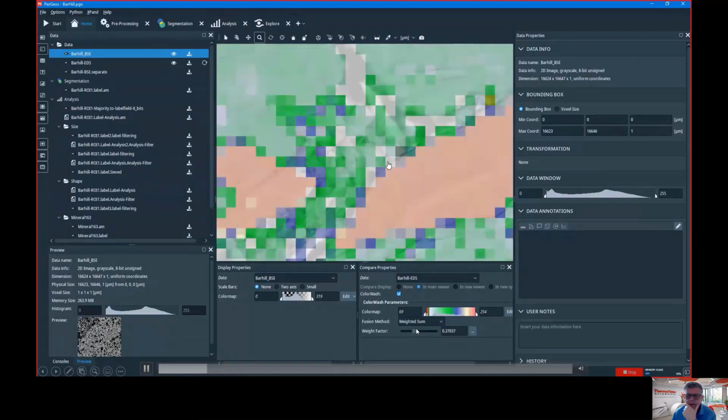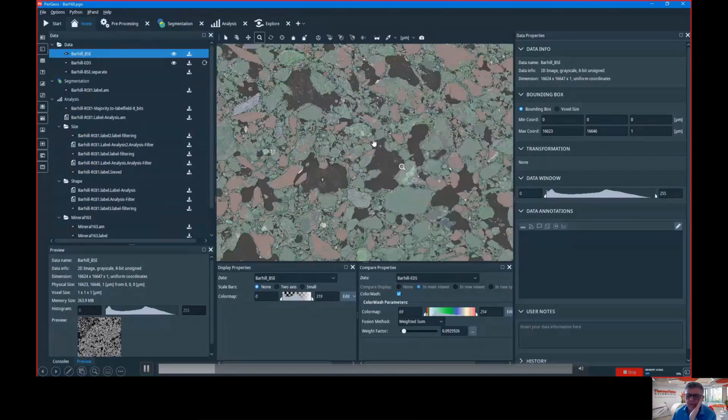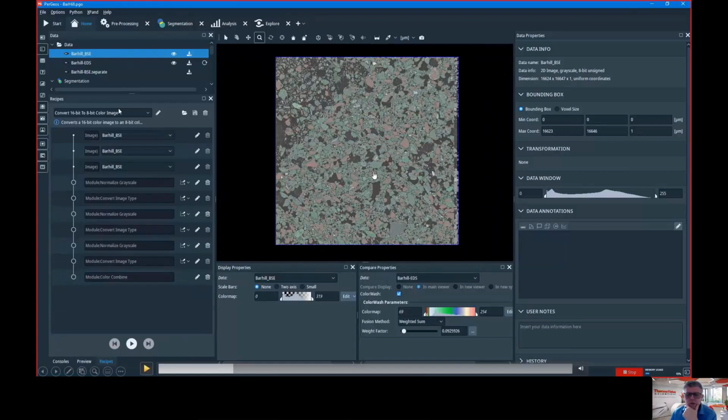This is what you usually get, something like that. So it's not so obvious to say what the mineral of each grain is, because probably they are a mix of minerals. But if you want to do some statistics, like a grain size distribution of quartz, you may decide to say, okay, I can assign to this grain a single mineral, the most important, the most relevant, the most present. So how do I do that?